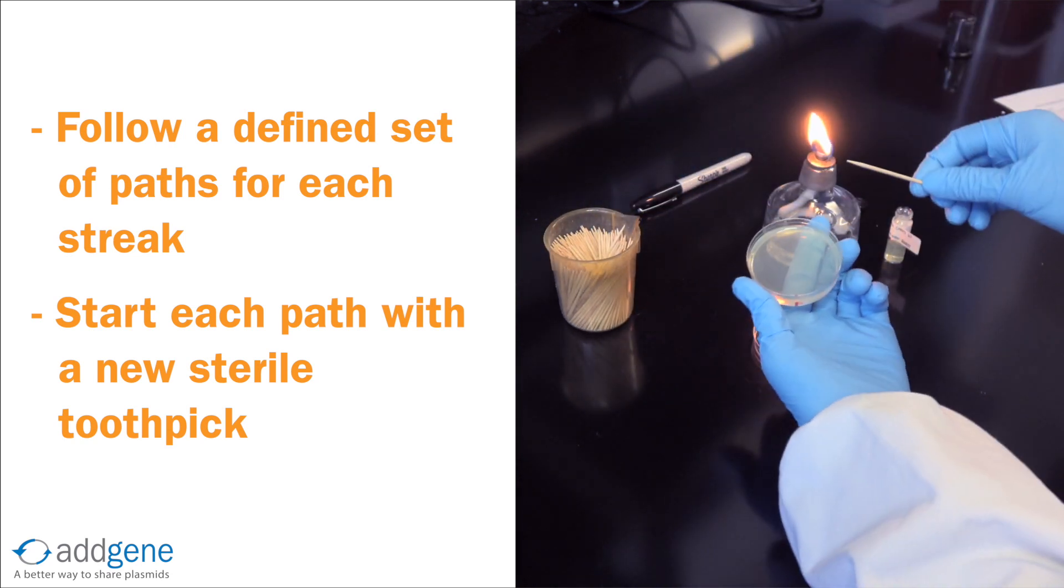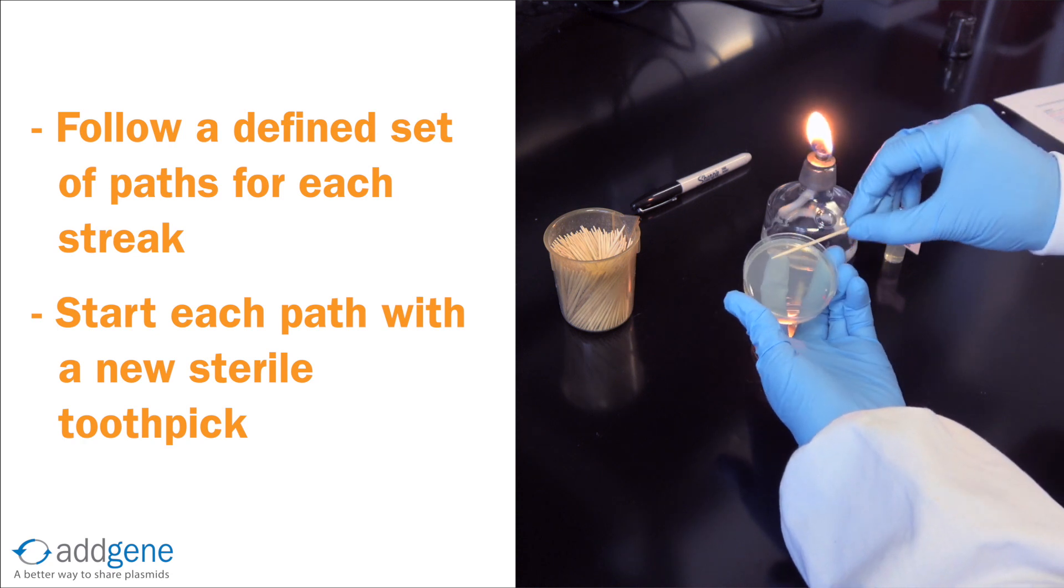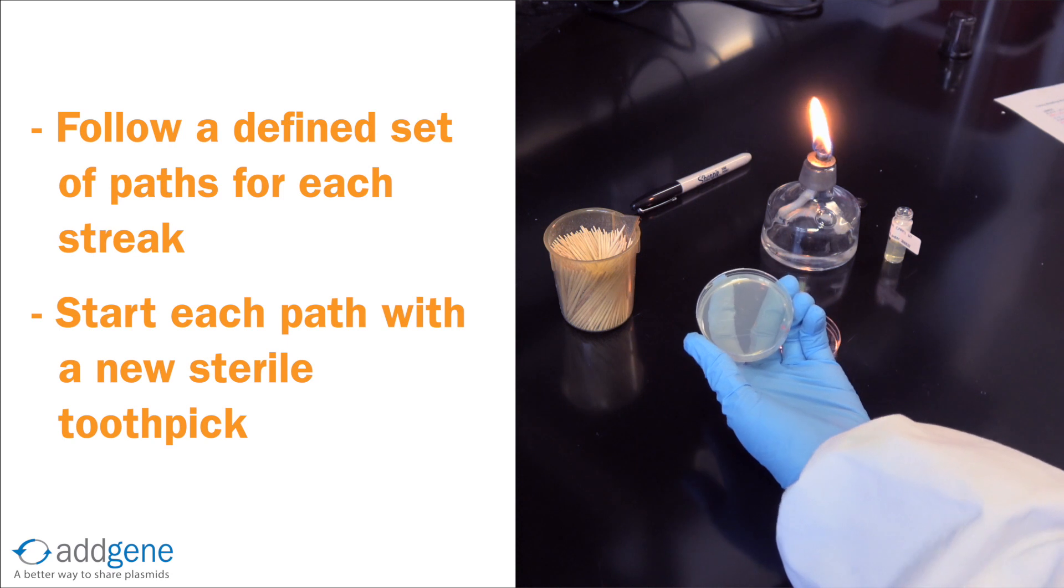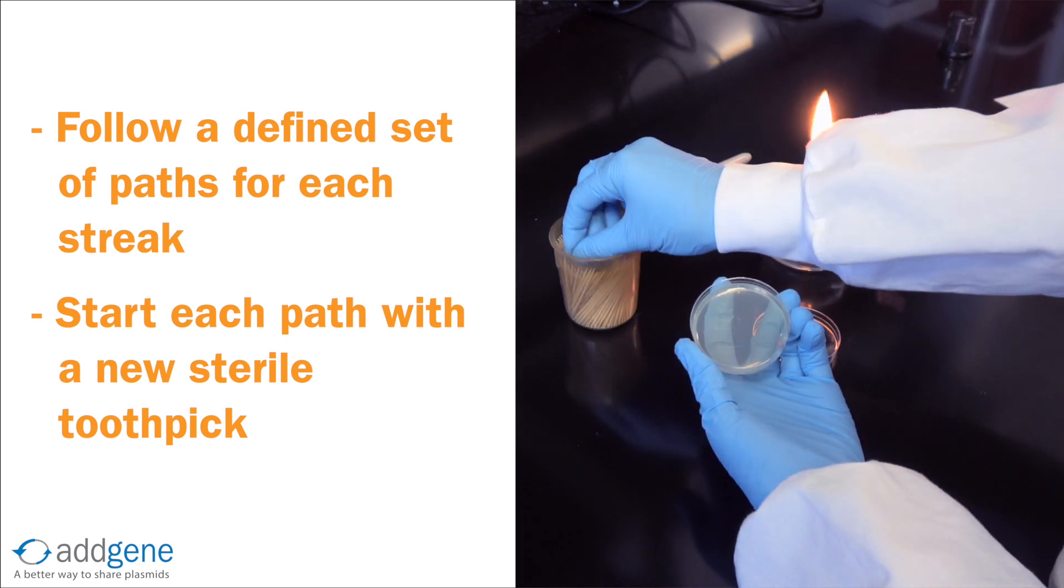We then dispose of the first toothpick, turn the plate, and use a new sterile toothpick to start streaking a new path from where we left off. Again, we streak over one-third of the plate and end the path near the edge.